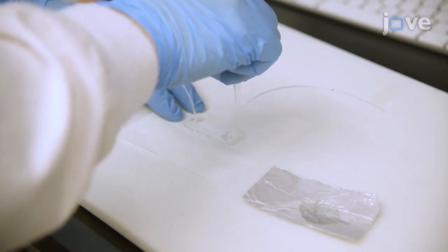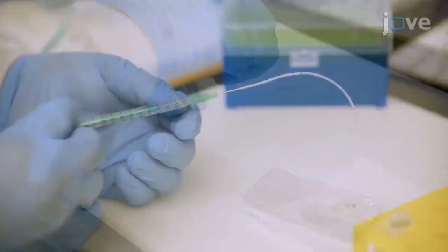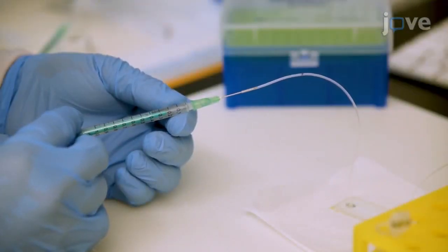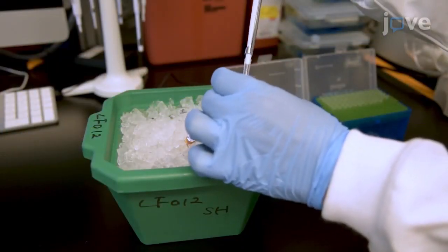My advice to first-time users is to closely follow the detailed steps laid out in this protocol. Visual demonstration of the hands-on procedure will aid in successful implementation of the technique.